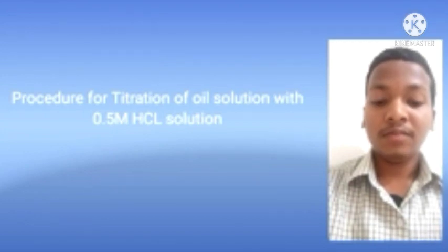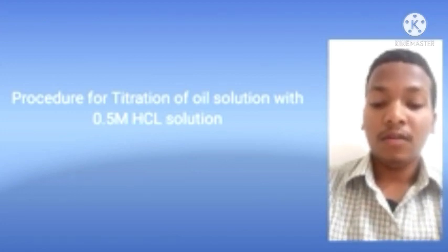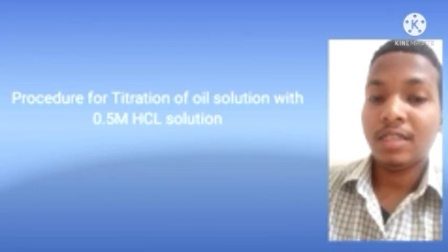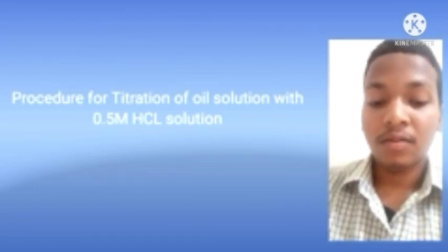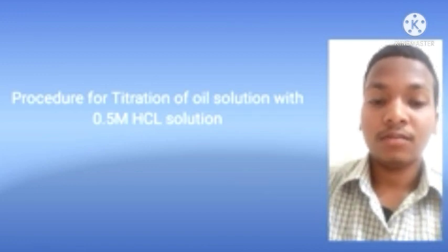Step 10: repeat steps 8 and 9 and take 3 readings and note the observations in the observation table. That's how we get this observation table of titration of oil solution with 0.5 M HCl solution.